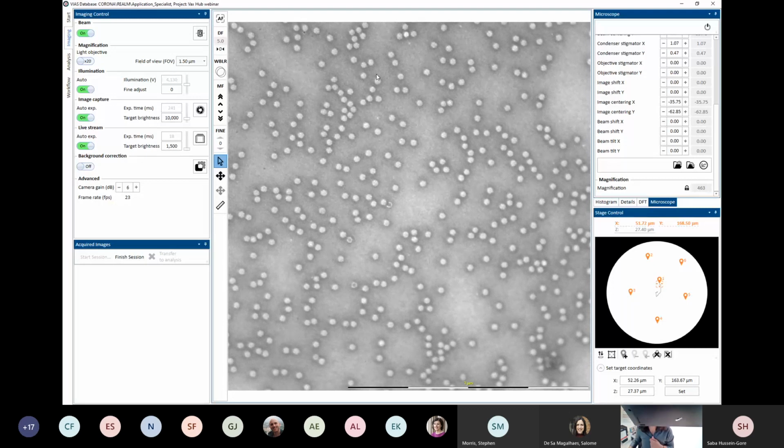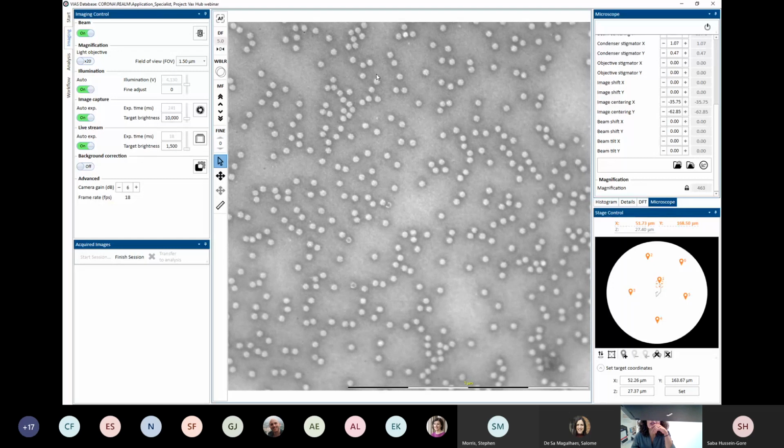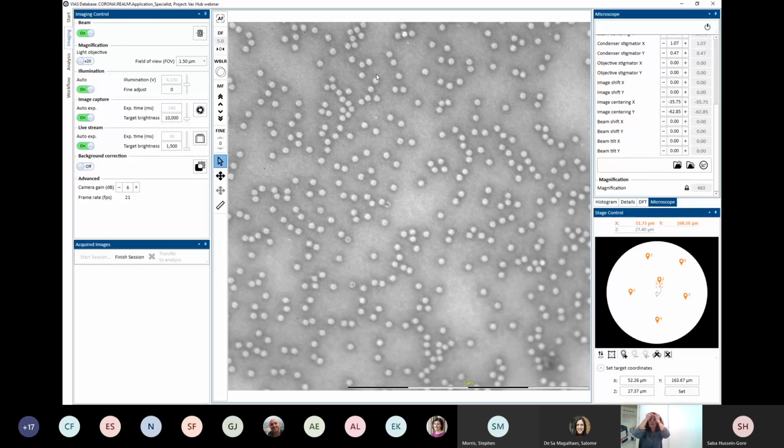Oh, there's a question. It says, hi, sometimes I found that the sample film broke down when the exposure to the light was too long and if the sample is too concentrated. Does this happen with the MiniTEM? Thanks. So thanks for that question. It's nice to know that someone is listening, it's great.